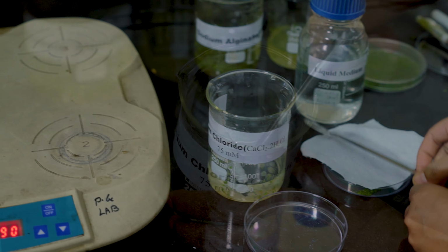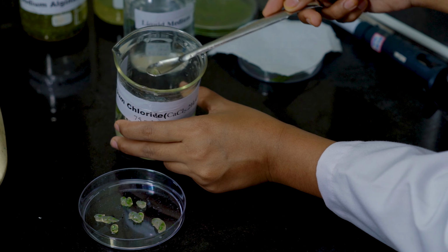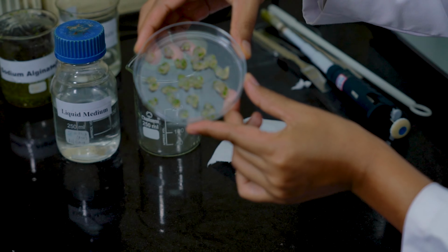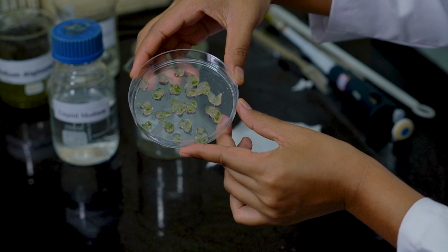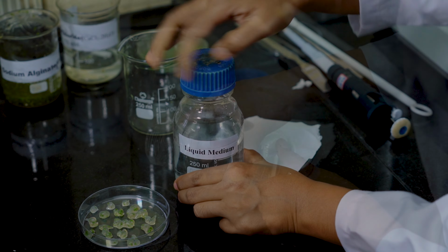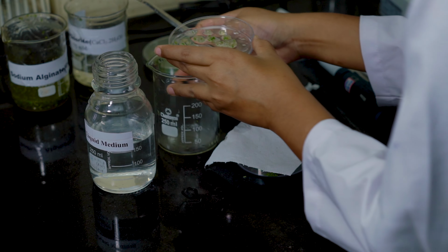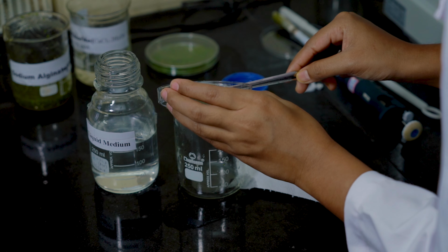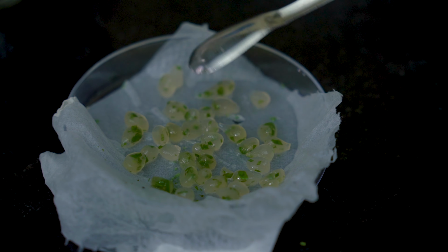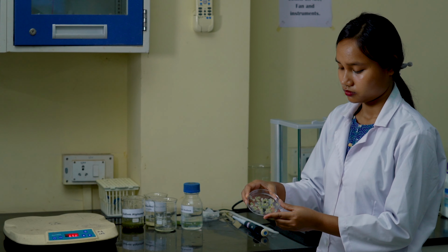Now transfer the beads into a Petri plate. Now as you can see, these are the artificial beads, and these are known as artificial seeds. Now these will be washed with MS basal medium and blot dried using filter paper. So MS medium is being used to wash. Now these beads are blot dried using filter paper. Now artificial seeds are ready.